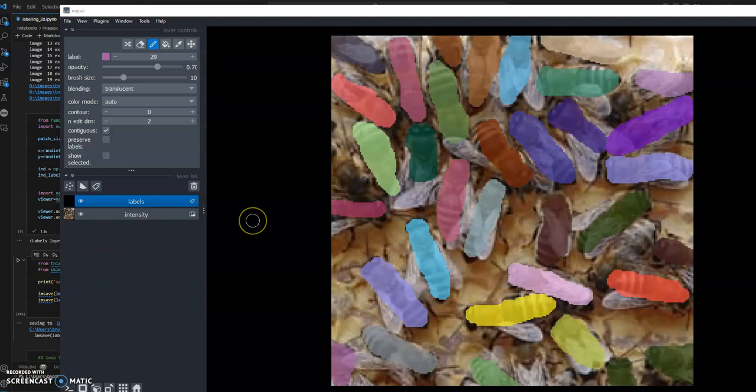Okay, I actually paused the recording for a bit because you probably didn't want to watch me draw every single bee. But yeah, I labeled every bee pretty quickly. I'm doing this to test some of the utilities that I've written, and also to help out on the forum. But if you're doing it for your real bee research project, it took me maybe 3 or 4 minutes to label all these, but you might spend 20 minutes, 30 minutes really carefully labeling the bees here.